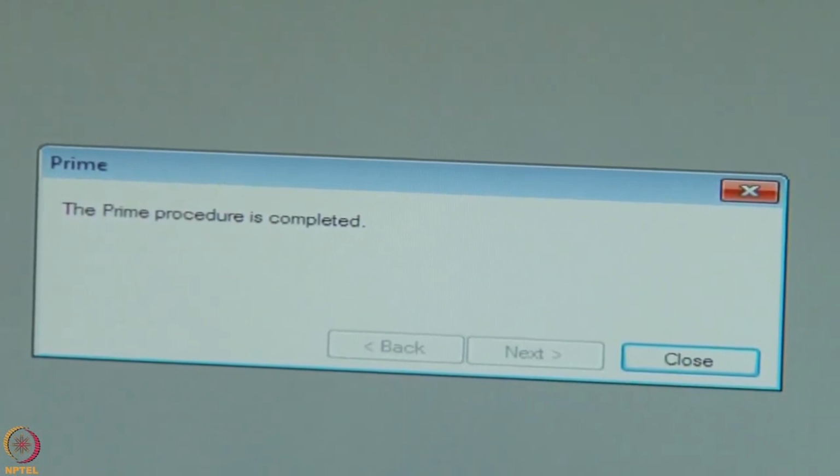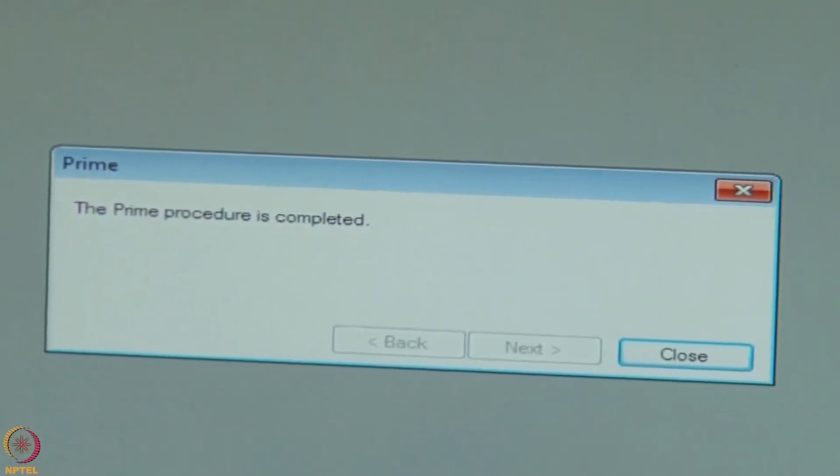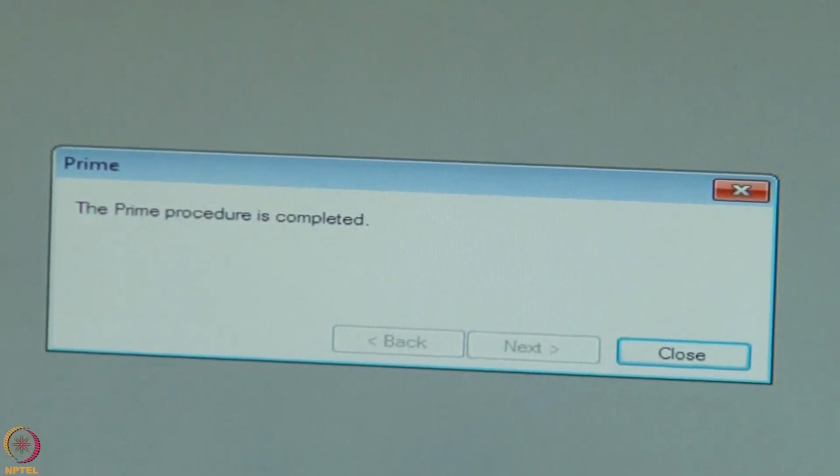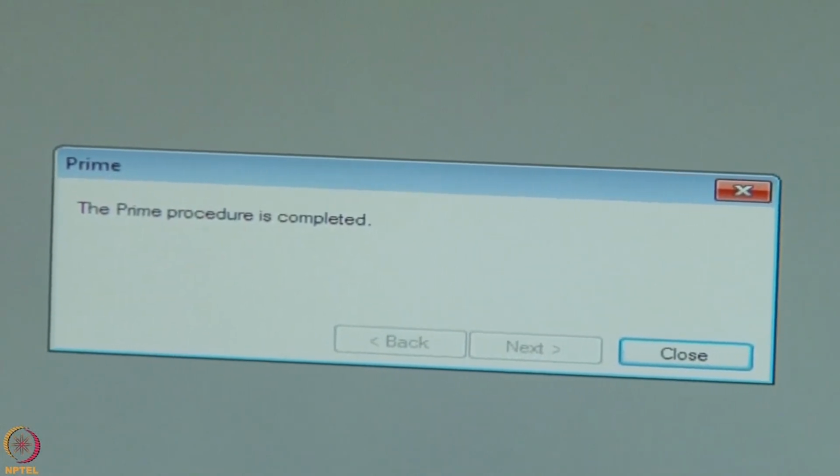We will do an immobilization of a ligand. In this case, today we are actually immobilizing anti-beta 2M antibody. For that immobilization, let's prepare a wizard. Before we set up an immobilization protocol, let us understand a little about immobilization levels.